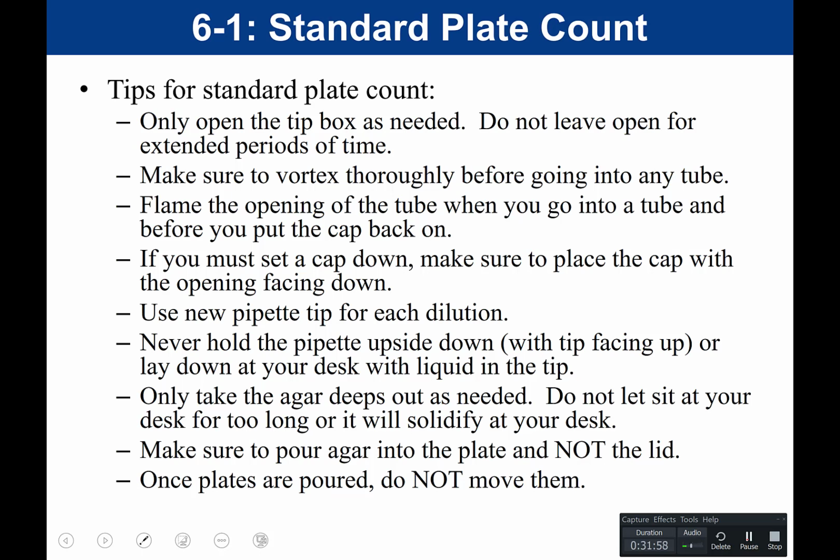So it's a good idea to get a new tip for each dilution. Never hold your pipette upside down, meaning if I have liquid in my pipette, I don't want to turn it upside down so that the liquid is no longer in the bottom, the liquid is on the top, because the liquid then is going to go into the barrel of the pipette and it's going to contaminate it. So you always want to keep your pipette oriented so that the tip and the liquid are facing the bottom, and you never turn it over.